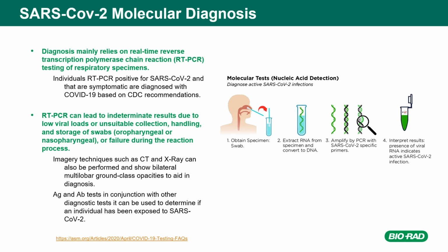Droplet digital PCR is a uniquely suited molecular tool for diagnosis of SARS-CoV-2 infection that, in addition to being a highly accurate and precise tool for frontline diagnosis, may help in situations where other molecular assays struggle due to some of the reasons I mentioned before.